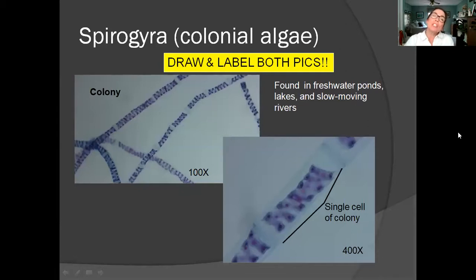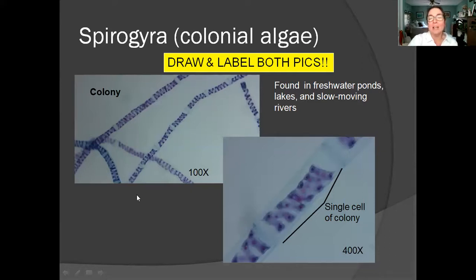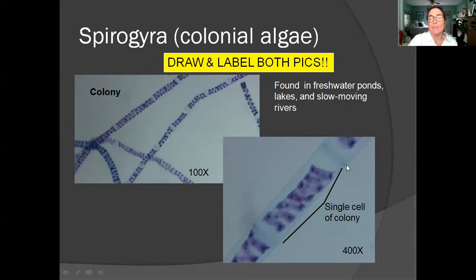This type of algae is called spirogyra, and I love it so much that I'm having you draw both of these pictures. It's a colonial filamentous algae and its cytoplasm takes a really cool shape inside of its cell wall. This is a colony — you see one cell attached to another, attached to another. They can live in this form, but they could also live on their own if the cells were separated. Here's a view at 100 times and a view at 400 times.